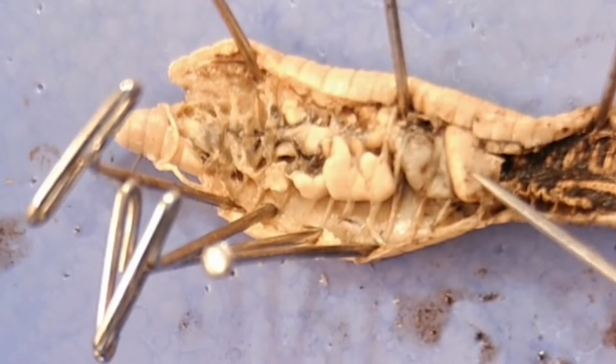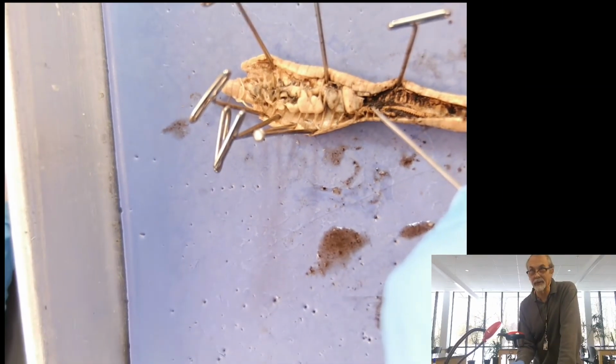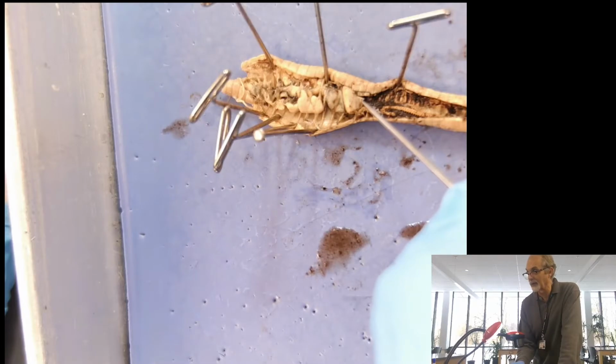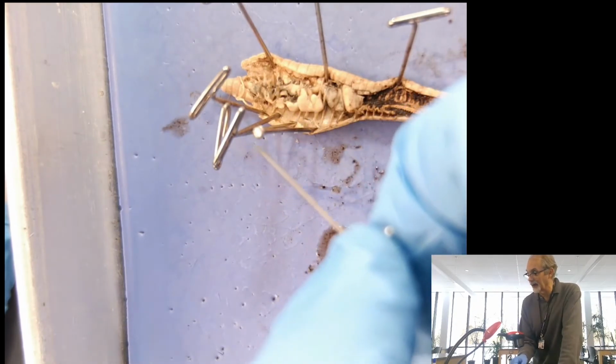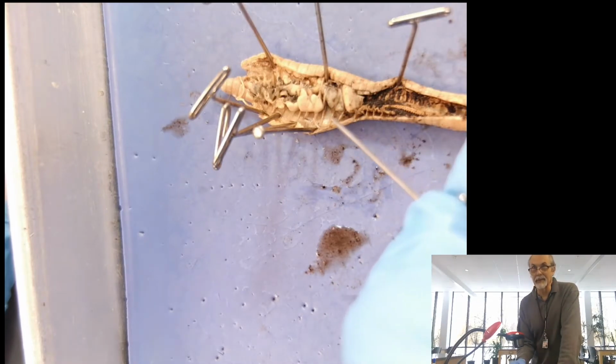Oh. That's the gizzard. Now, chickens have gizzards, and if you ever watched a chicken in a farm field, they'll eat stones because they don't have teeth. And the stones get into the gizzard, and the gizzard has very thick muscular walls, and as the muscles in the gizzard contract, in the earthworm, of course, they have sand particles that get ground together to grind up the food. Like a stone mill. Like a stone mill, that's exactly right.